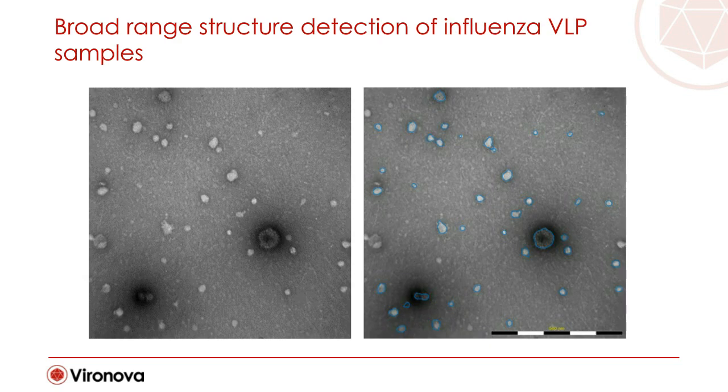To deal with these localized features practically in the MiniTEM, we would start with detecting all particulate matter in the images down to a specific size threshold. In this image to the right, you see most particles of interest detected with the blue line surrounding them, but which are of different kind and of different biologic relevance. Also, we see debris in the background, but we will disregard that right now.